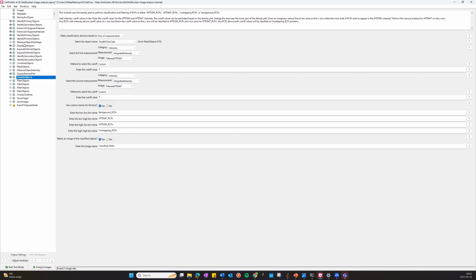And then we want to deactivate the eye symbols for all of the modules. We don't want to see the output during the analysis. It will slow down the actual analysis and could create error messages. So we don't need to see them when we analyze. We've already looked at them in test mode. So we're just unclicking all the eye symbols. We don't have anything open.